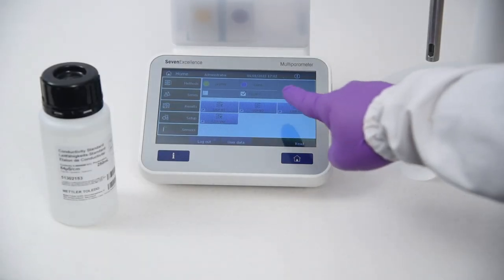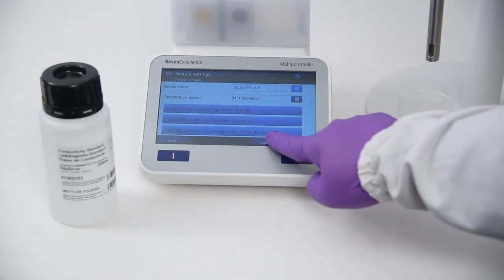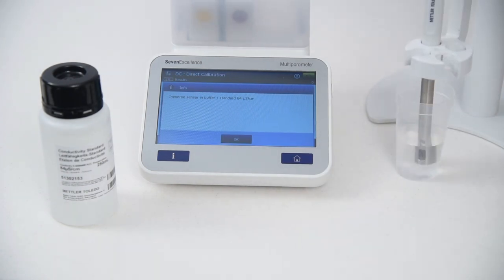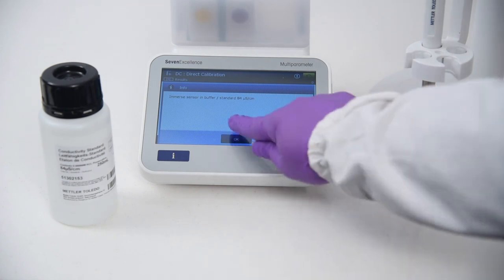If necessary, you can also perform a calibration in a low conductivity standard, like 84 microsiemens per centimeter, followed by a verification as described earlier.